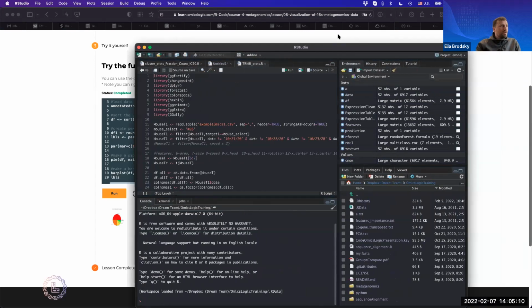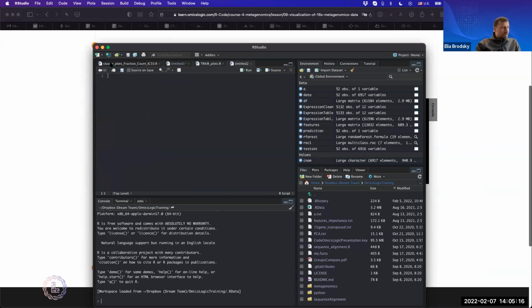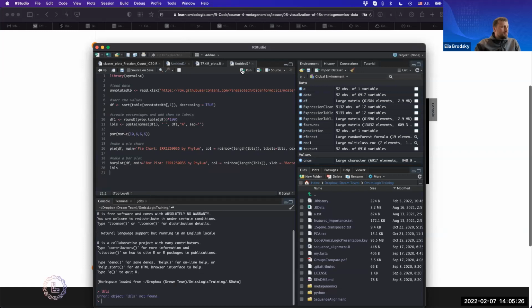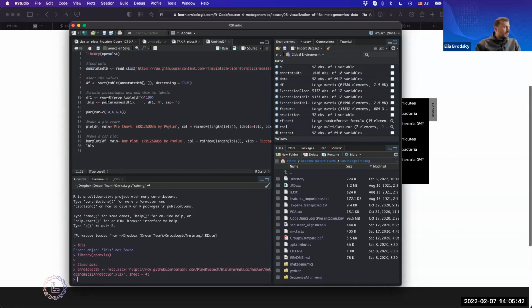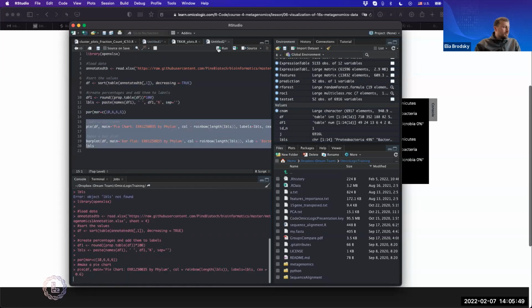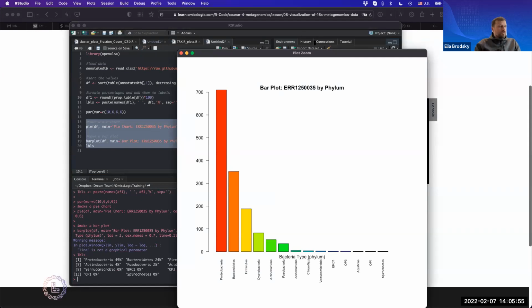Okay, so here's our RStudio. Let's make it bigger. Create a new script. Paste it here. Okay, and here, right, we have this library. I already have it installed. Let's run it. Okay, object labels is not found. So right here we have, so I think, what is happening? Let's run it like this. Okay. Like this. And run it like this. All right, and so there we have it. It also works in RStudio.